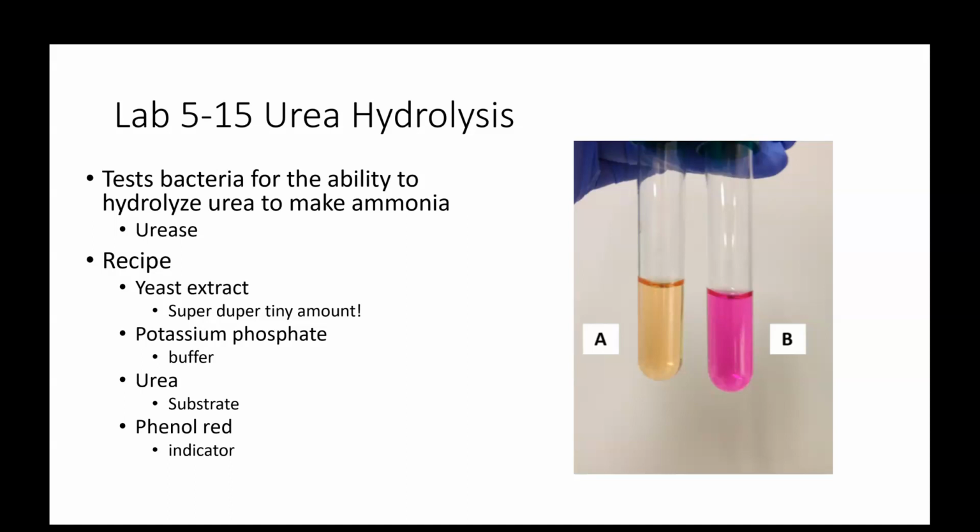So what does this test do? Well, it tests for the ability of a bacteria to hydrolyze urea into ammonia. And so again, what we're always really testing for is that enzyme. And the enzyme in this case that can make this reaction happen is the enzyme urease.